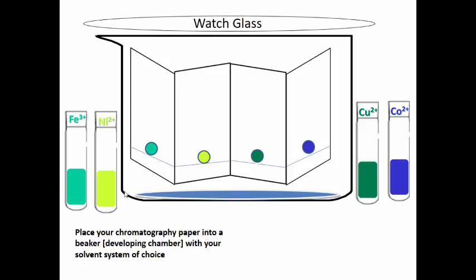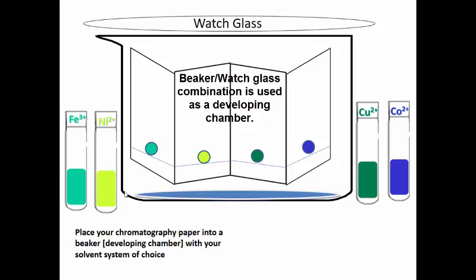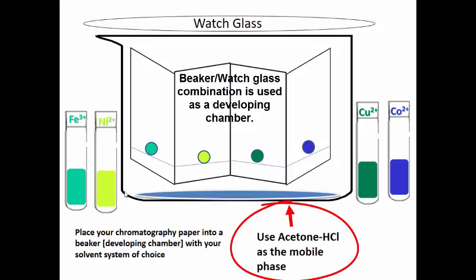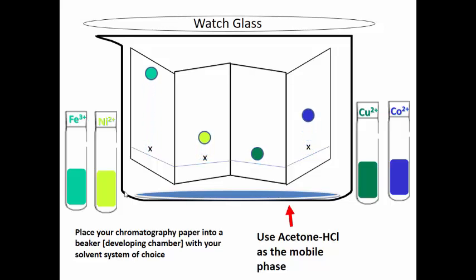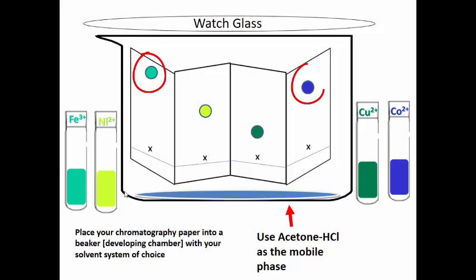Now it's time to develop it. I have a beaker and a watch glass — that's my developing chamber. I'm going to use my acetone/HCl solvent mixture as the mobile phase, which is going to drag the compounds up the paper through capillary action or wicking action. Notice the iron moved really quickly, and then the cobalt moved really quickly, but the copper and the nickel did not.